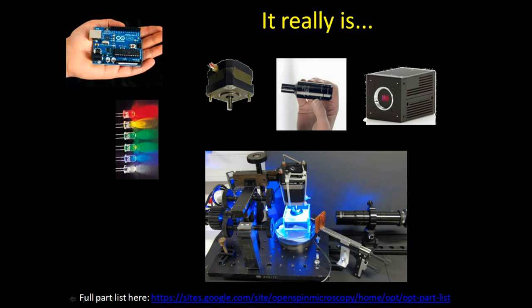And the camera sits behind here. For this case, I've used a very cheap camera, a €600 camera. It was all the budget that I had. Obviously, if you get a better camera, you get not just higher quality images, but it's also easier to control the camera and to run the whole setup.